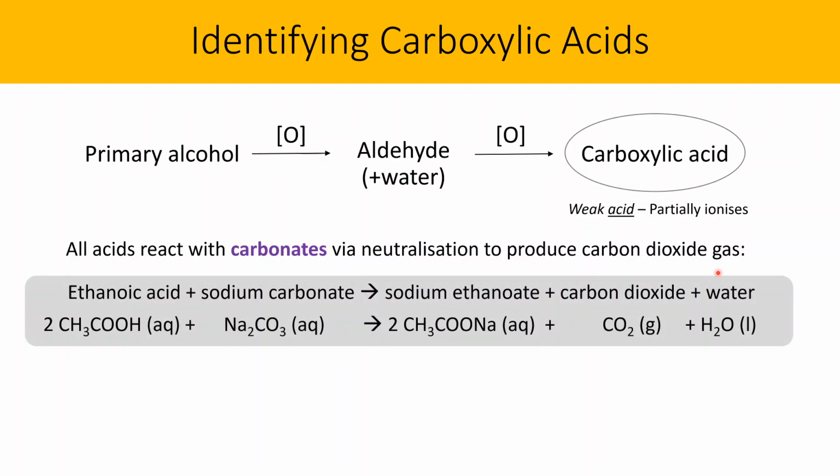So here's a reaction equation for how an organic acid like ethanoic acid could react with something like sodium carbonate. Okay, so ethanoic acid plus sodium carbonate, there's the formula for aqueous sodium carbonate there, is going to form sodium ethanoate, okay, because we used ethanoic acid. So whichever carboxylic acid you use, you get an anoate of that carboxylic acid. So just some wordplay here.